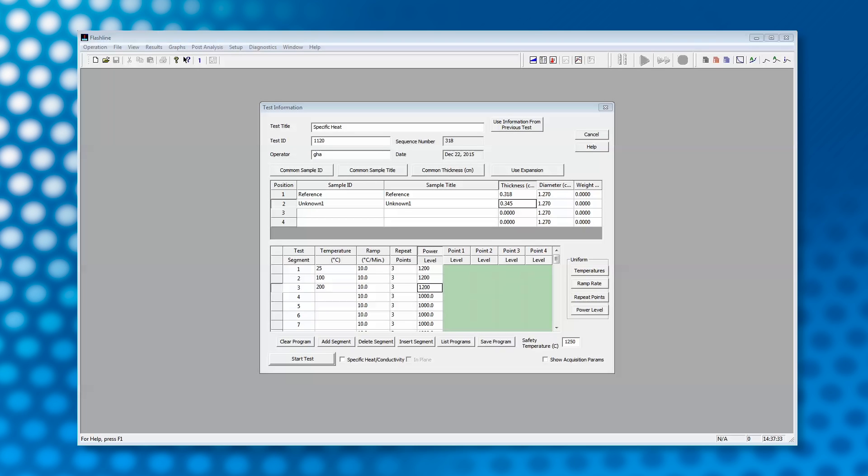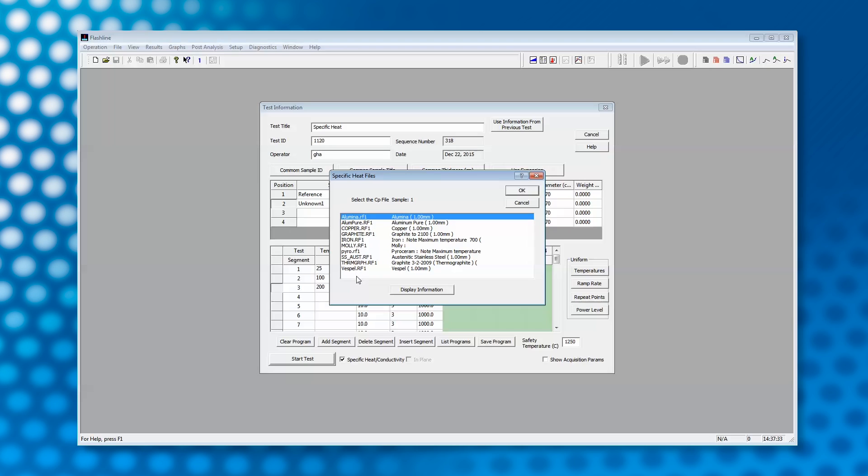After we save the density file, we can start the test. In the test setup page, after entering the test information and temperatures, we check the specific heat box and the software will prompt us to choose the specific heat and density files for the reference sample and the density file for the unknowns.